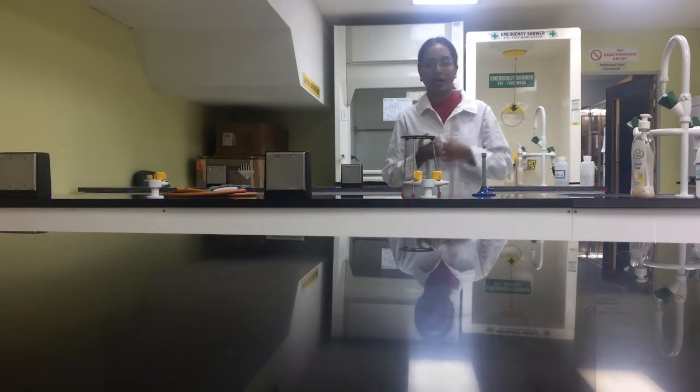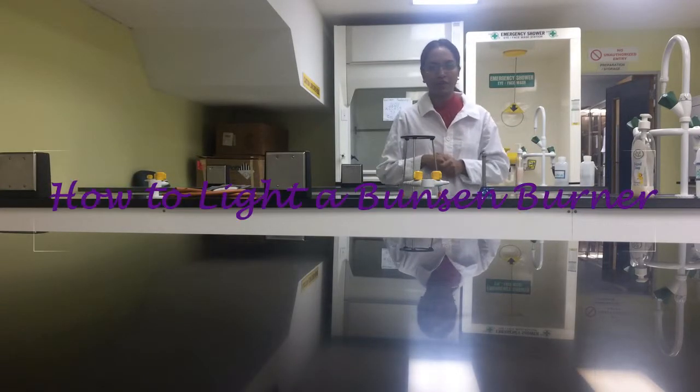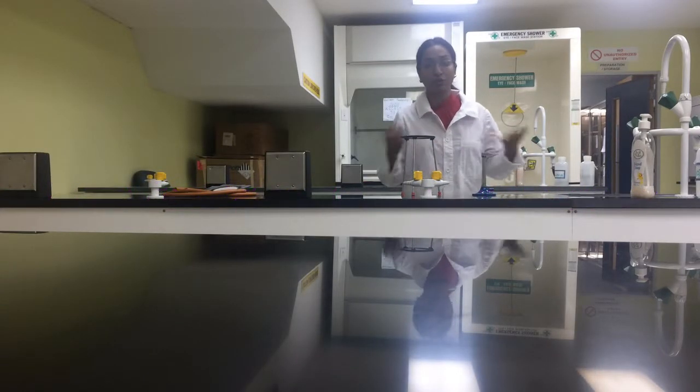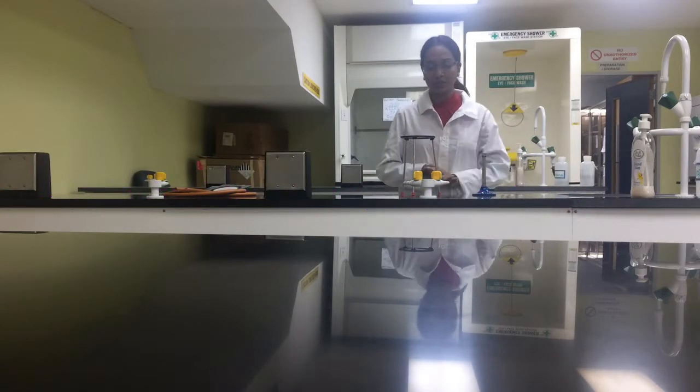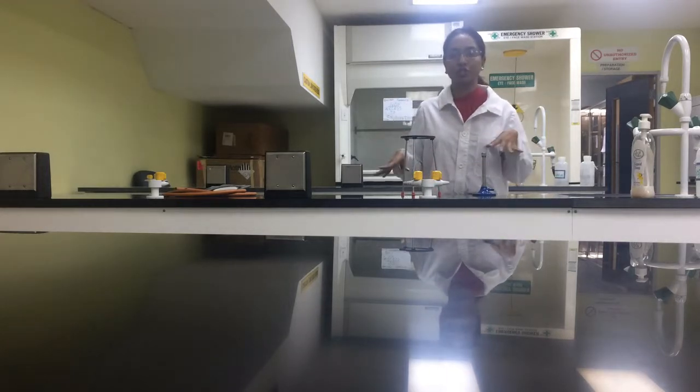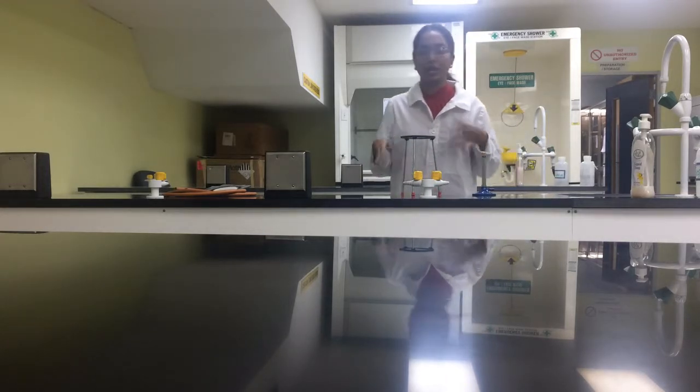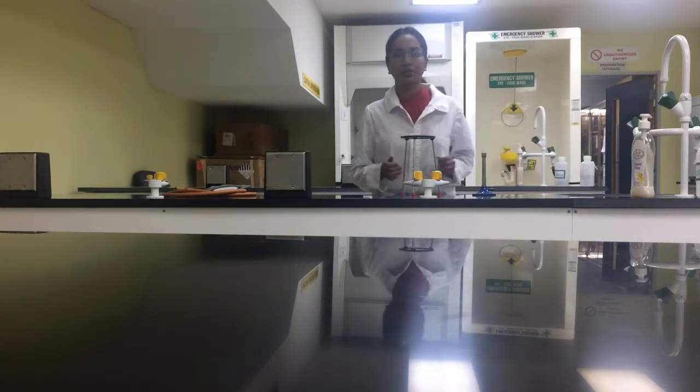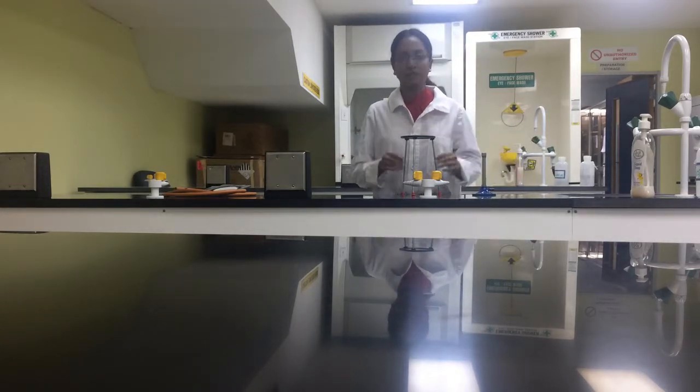Hi everyone, so today I'm going to show you all how to light a Bunsen burner. Now, I put a camera here so you all can see me, but I'm just going to go through the materials and apparatus that you're going to need.